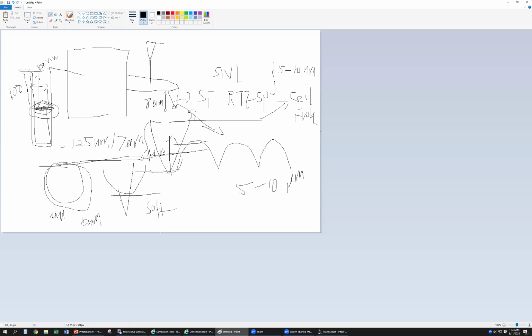If you want to get the material property here, we don't have a probe for you. Okay, if we use this, then what will be the distance? The feature will be like this, and this is the middle part, right? The material. If I use the AFM to measure the depth, the feature will be like this, or the material will be destroyed and we'll get the whole trench.